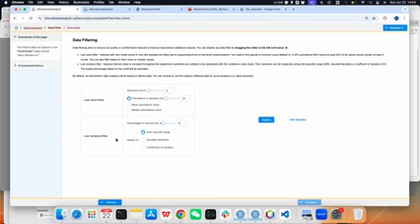And if the data have very low variance or it's constant across all the samples, then it's not meaningful for our comparison study, so we can remove those. The detailed explanation is here, and we keep the default mode and submit to remove. And here we can see that some low abundance and low variance features have been removed.